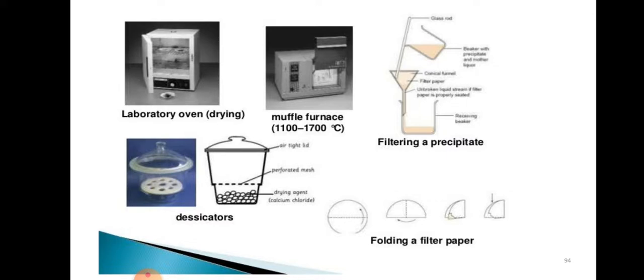That is an oven, this is the muffle furnace, this is a desiccator to hold a sample, and an oven for drying of the sample. Here in a beaker we are going to take a coal sample along with barium chloride. When we add barium chloride, sulfur is converted to barium sulfate, which is a precipitate, and we are going to filter this solution.